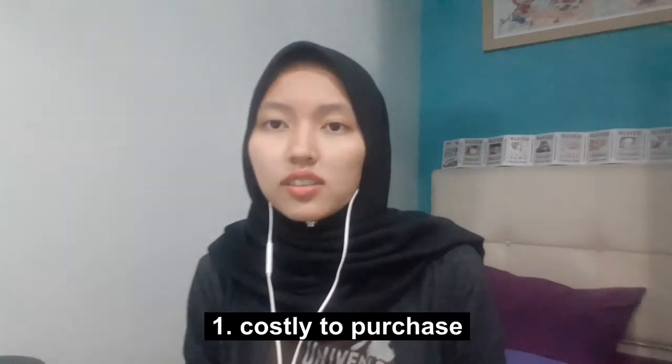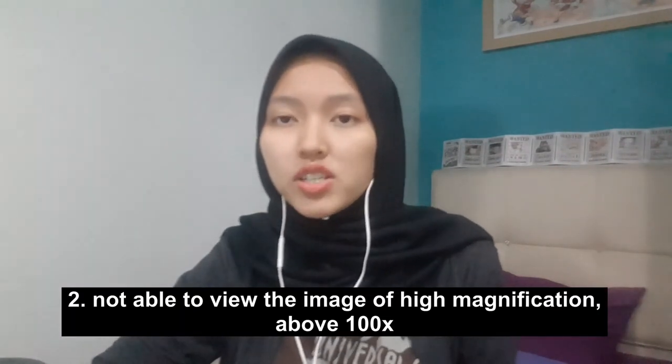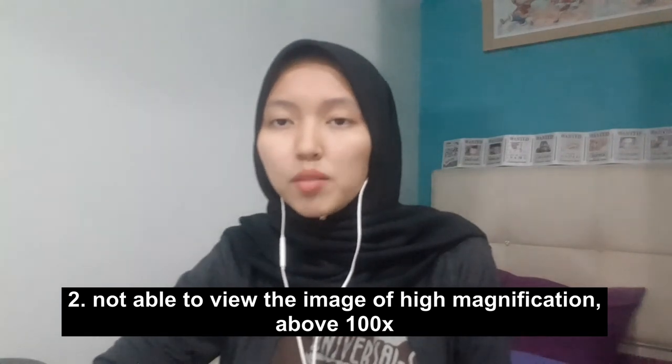Wow, stereo microscope surely helps us in many ways, but every instrument has its own limitations. For stereo microscope, the Galilean optical system, which is an essential part of the microscope, is quite expensive to purchase. Generally, the microscope is costly to purchase. They have a low magnification power, hence they are not able to view images of high magnification above 100. Hence, they can't be used to view tissue structures or other structures.